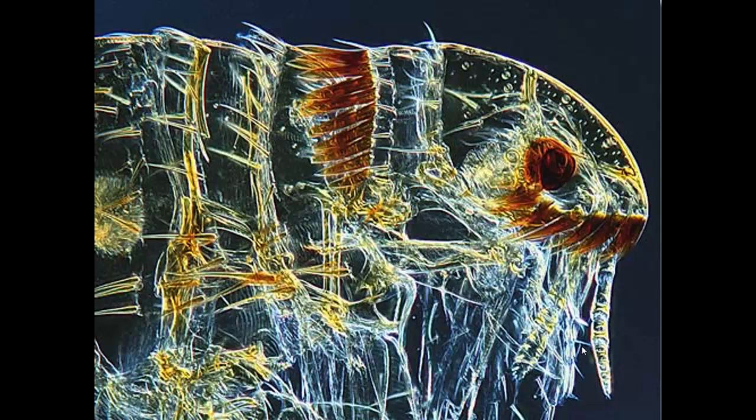Here's a good example of a dark field illumination of a close-up of the common flea. Isn't he a cute little guy with his little mustache?